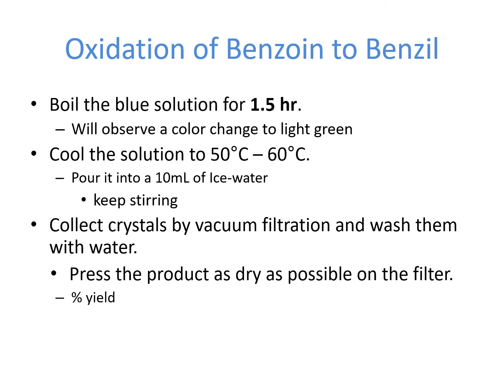That's an indication of full oxidation. And the next step is to cool the reflux to about 50 to 60 degrees Celsius, and then pour that solution into 10 milliliters of ice cold water with stirring.